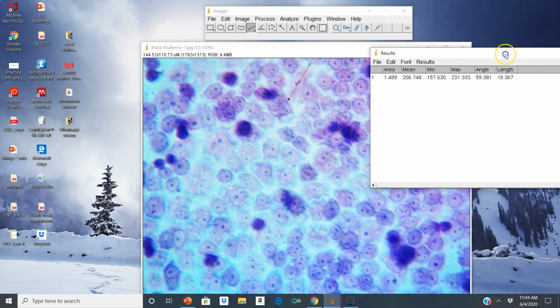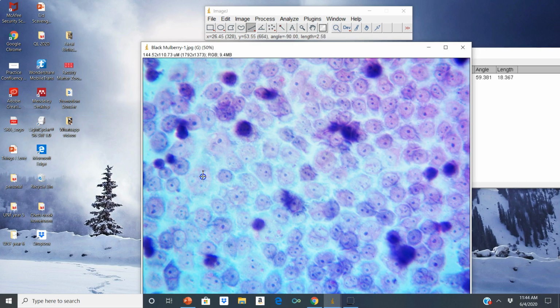I am then going to go ahead and test it again using one of the small nuclei. So I want to do a small nucleus to make sure it gives the correct one. There you go. I'll do this tiny nucleus in this multinucleated cell. And I do measurement, and lo and behold, it shows the much smaller length. In this case, it is 4.032 micrometers.